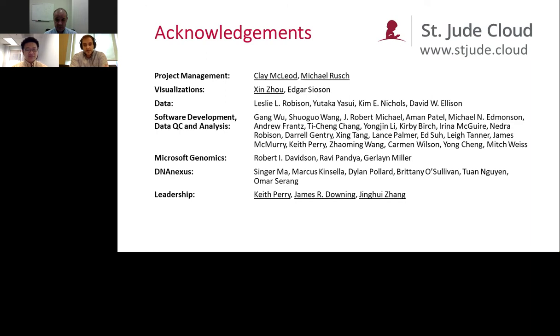So on our documentation site, we have a full guide, a full write-up from the authors of the tools and my engineers talking about how do you run this tool, how do you get your data in there, what are the different parameters that you can input, what are the results files that come out, and some gotchas about how you might interpret those results, and also known issues, things like that. So we hope that that's where people are going to learn how to run our tools and what our tools do. But as always, we're trying to constantly make improvements to that. So you can always reach out to us at stjude.cloud/contact and ask questions, and we'll also be updating documentation frequently.